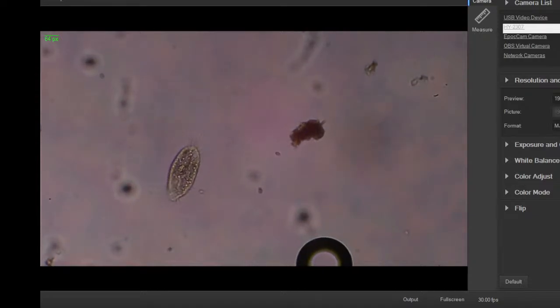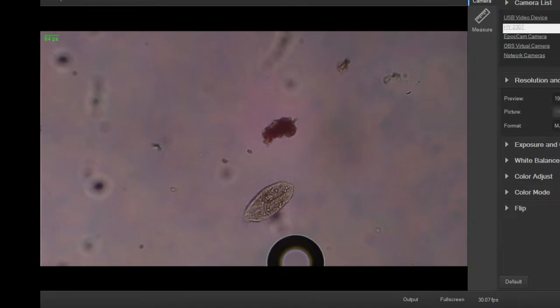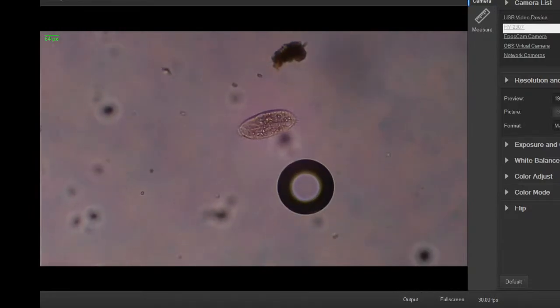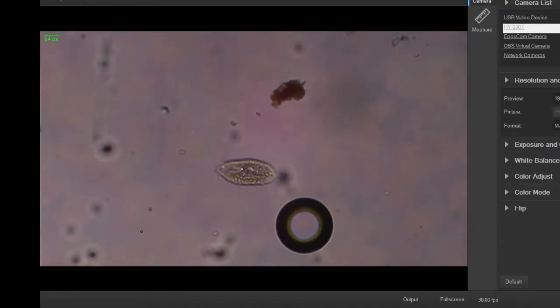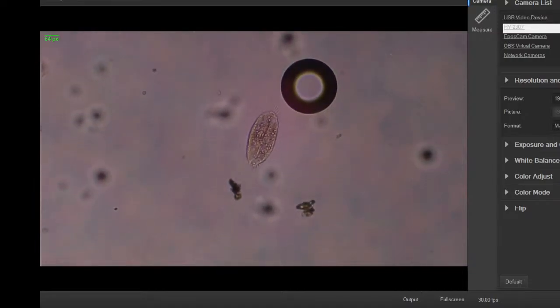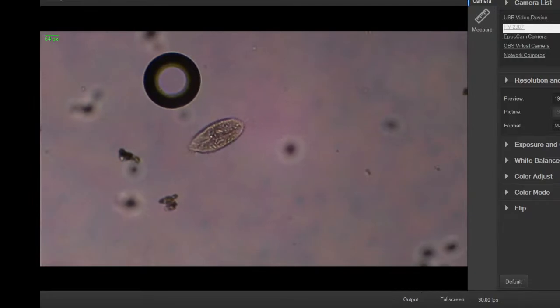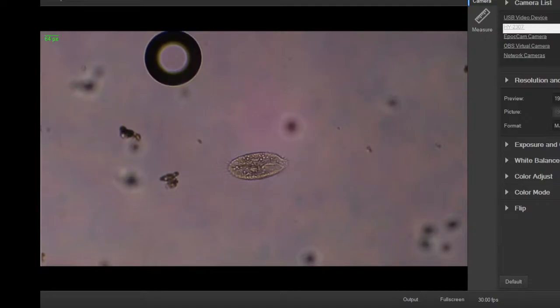Sometimes they're very easy, like Paramecium caudatum, which is the most common paramecium around. Pretty easy to tell. Or this Amoeba proteus, which is very common compared to some of the amoeba around. But a lot of these animals, you're lucky if you get them into just a group, for various reasons. But yeah, this is a nice little specimen.